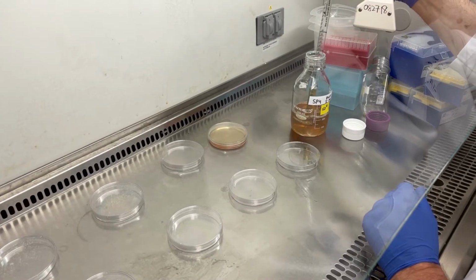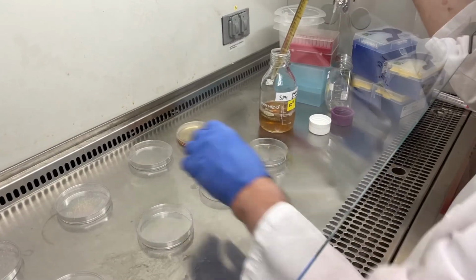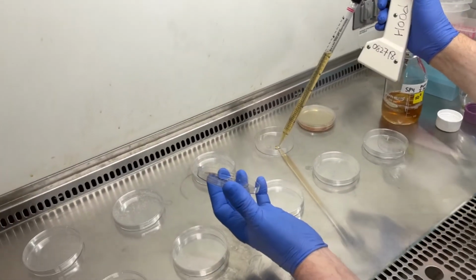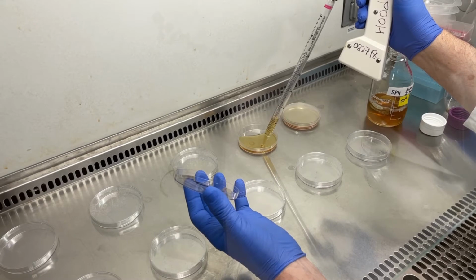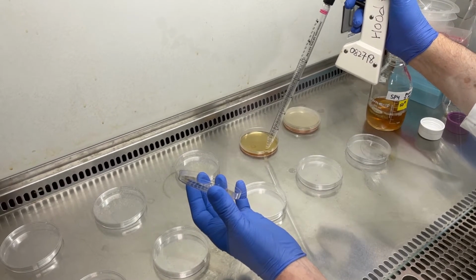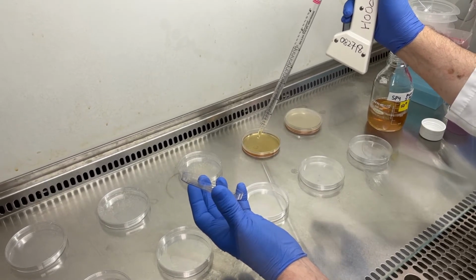We'll talk about bubble removal in a minute, but this can be repeated into as many plates as you wish, working fairly quickly to avoid the fluid setting up in the stock bottle. Again, ejecting the fluid, but not ejecting all the bubbles at the very end.